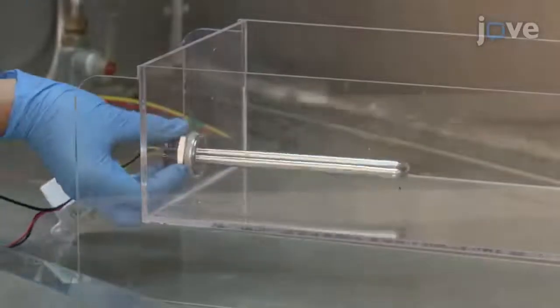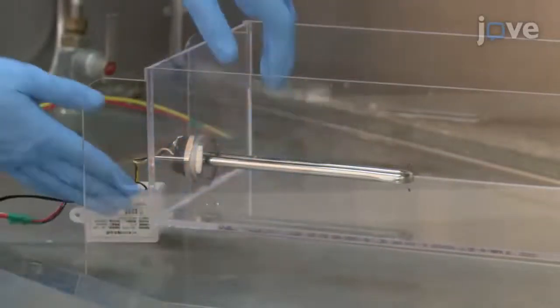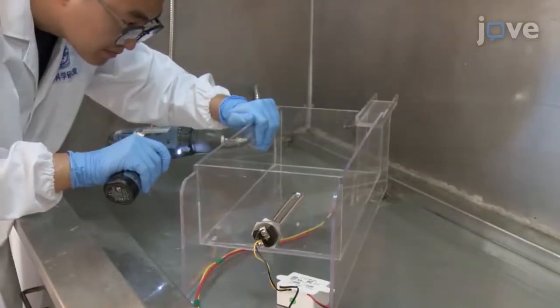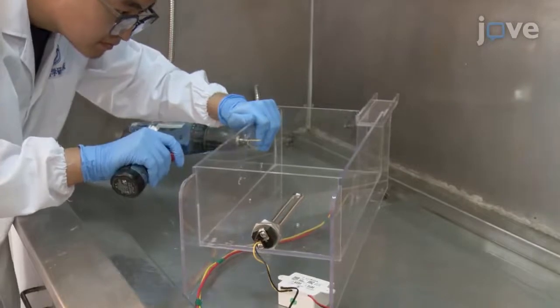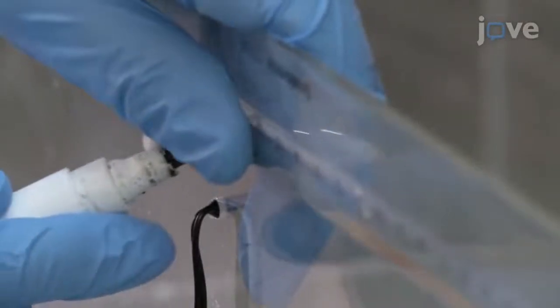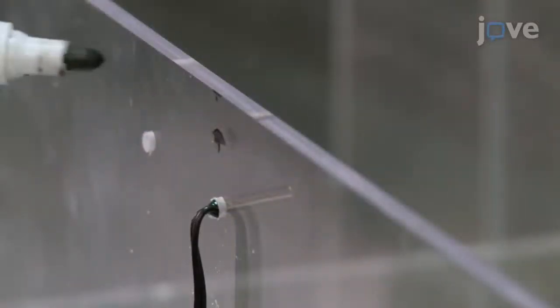Install the tubular electrical heating element through the hole in acrylic board number 2. Using an electric drill, make a small hole in acrylic board number 7, and install a digital thermostat on the tank, making sure that it is at least 1 cm below the level of the intended water surface, which is indicated by the black dot on the tank.